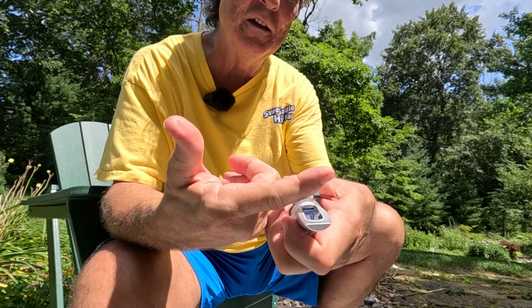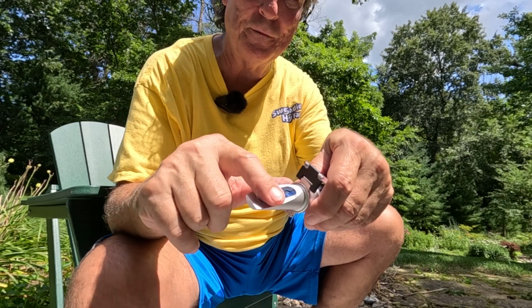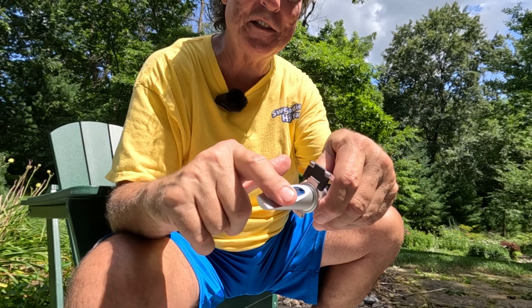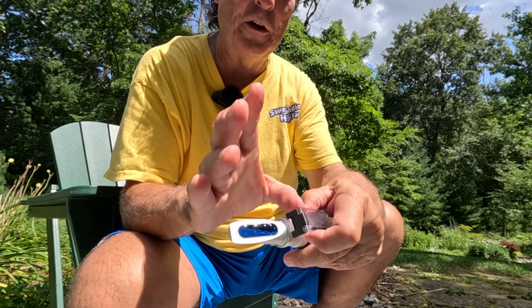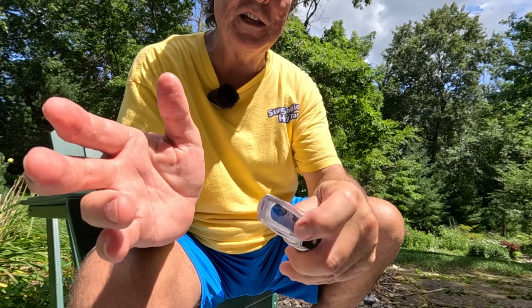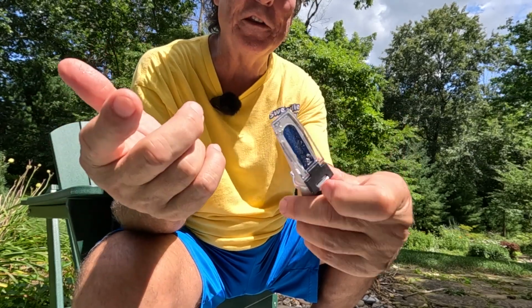Let me show you kind of what it looks like. I'm using some honey, and you just put some on your finger, and then you simply wipe it across the screen of the glass and get it coated. And then when you cover it up, you're going to see it completely coats on the inside, and you want it to be that way.